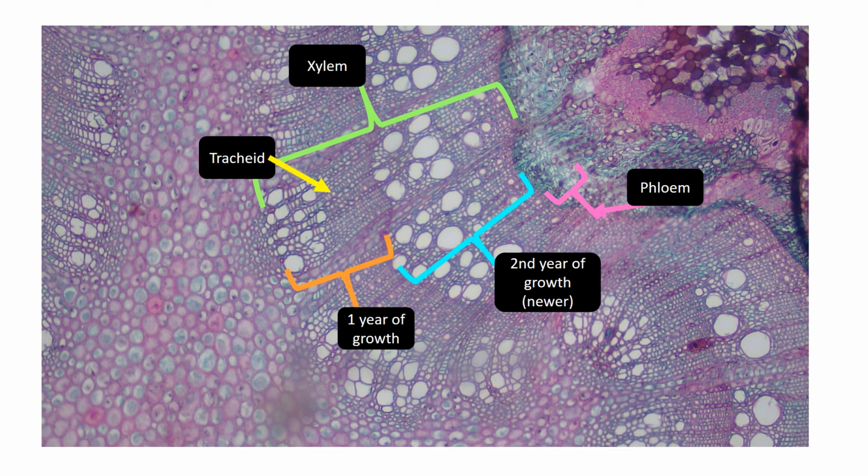And then going into the cell area, we can see the actual tracheids, which are again similar to what pines have. Tracheids are found throughout vascular plants. But then you have vessel elements, which are not exclusive to angiosperms, but they're very often found in angiosperms. Angiosperms have a ton of these. And so these are useful in transporting water in larger amounts. So their tracheids and vessel elements do the same thing of water transport, just vessel elements are bigger. And so it's a bigger pipe, and they can transport more.